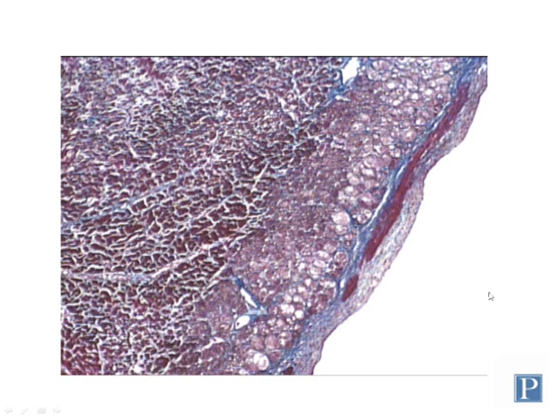This would be a chamber of the heart where blood is stored, and so this layer right here is referred to as the endocardium. The endocardium has multiple components. The superficialmost layer of the endocardium is composed of endothelium, again, which is composed of simple squamous epithelium, the same type that lines all of the blood vessels within the body.